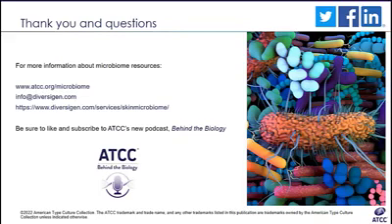Yeah, that's a great question. I didn't talk about it. We have a limit here at Diversigen, some type of quality control. I would say something between 5,000 to 10,000 should be good for coverage. Probably a little bit less for skin since it's a low biomass environment.